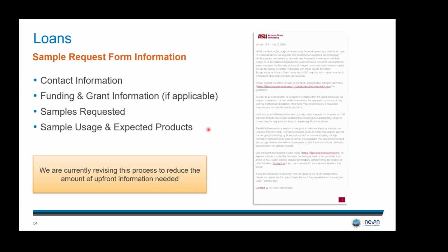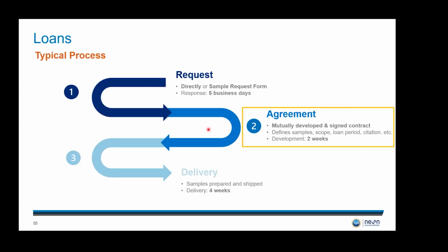That's totally acceptable and happens all the time. The second step here is mostly a review step. This is mostly in cases where there are multiple people asking for a specimen, or if someone wants to destructively sample a large portion of a sample type.